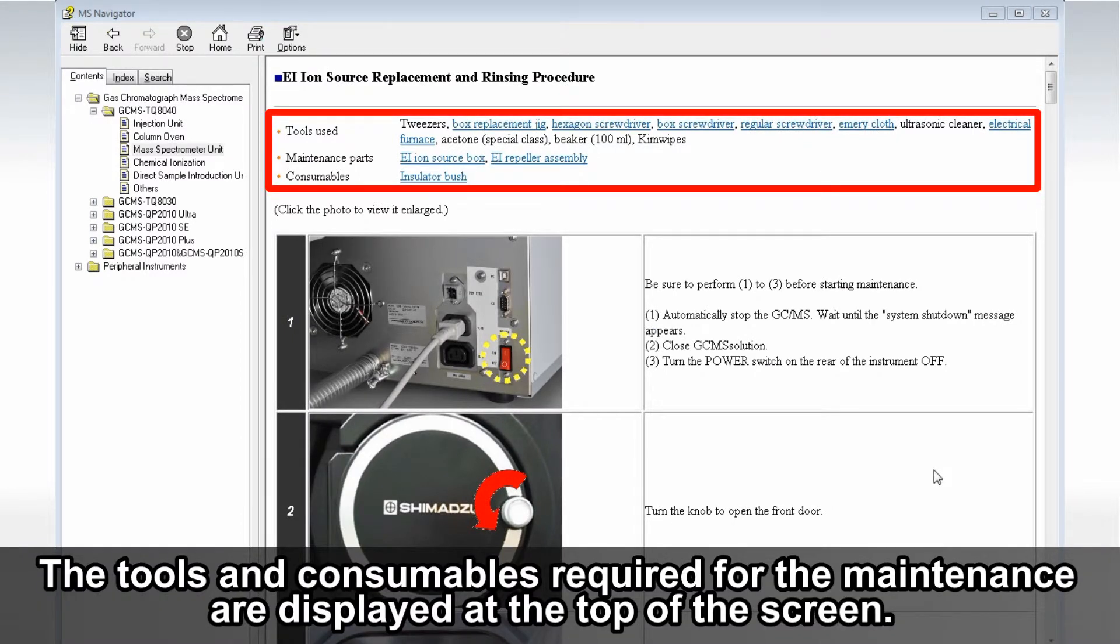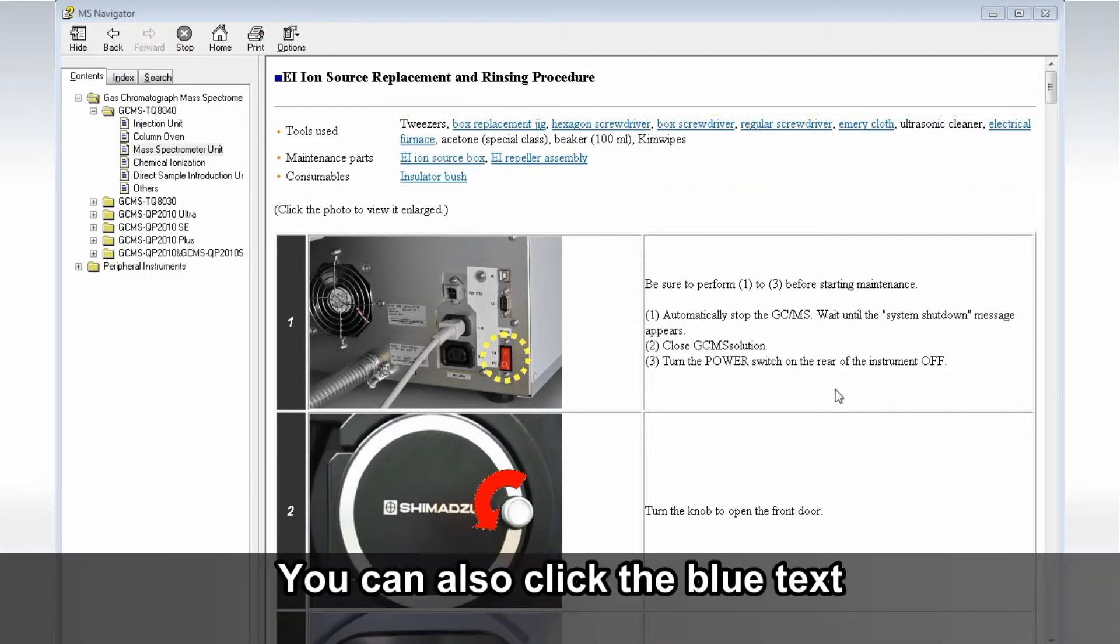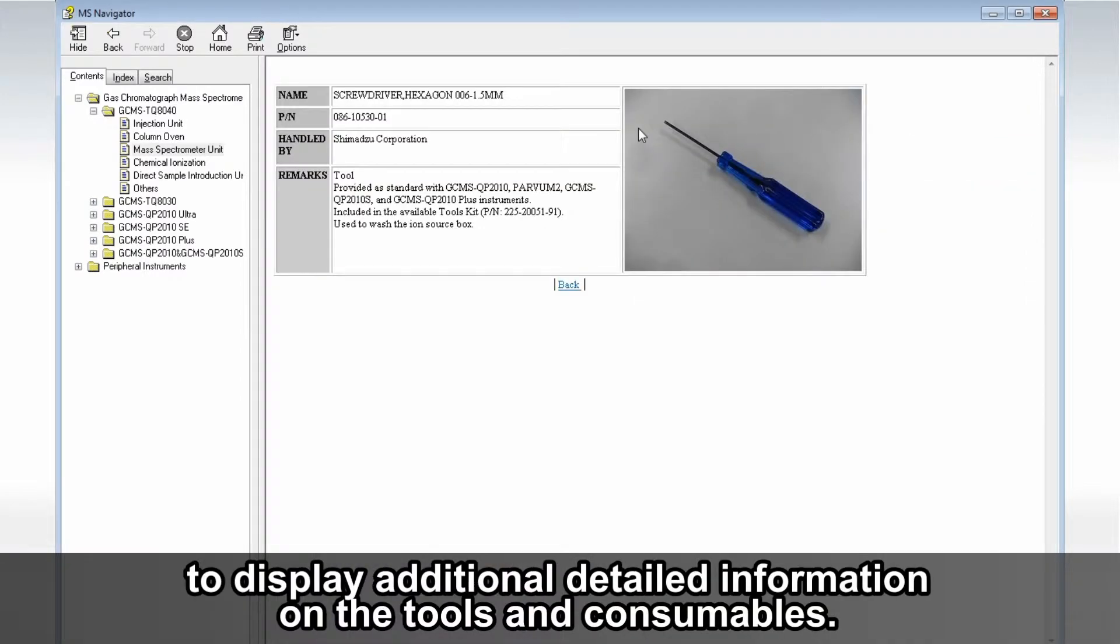The tools and consumables required for the maintenance are displayed at the top of the screen. You can also click the blue text to display additional detailed information on the tools and consumables.